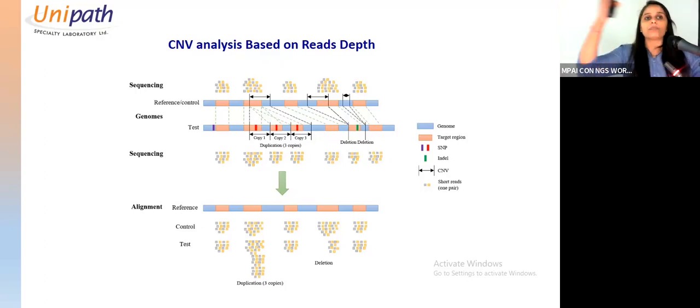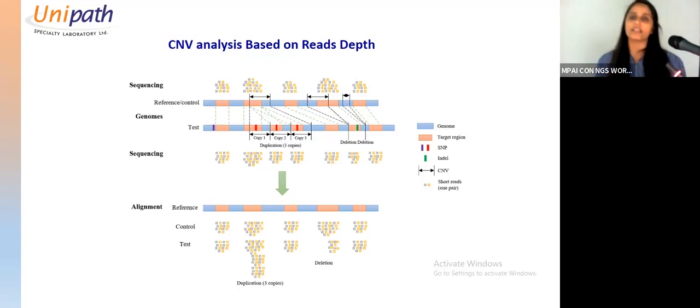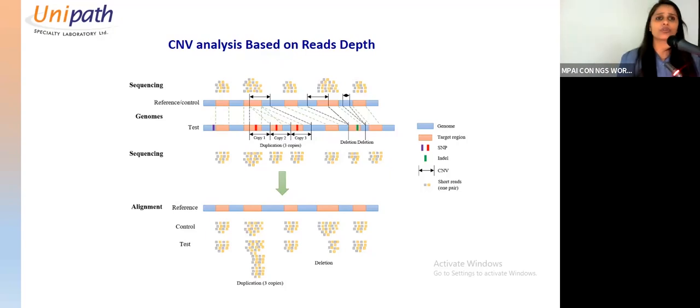Right? If you take a paper that is of red color, one color, and you tear it, you'll get red color pieces only. But if you take a paper which is multicolor, and you tear it, you'll get multicolor pieces. So similarly, if you are taking a control sample where everything is the same, you'll get coverage everywhere, because you generated data for the complete exome. But it is not like that, it is a probe-based enrichment, so definitely there is low and high depth, which means you have some places which are well covered and some which are less covered. So it happens in exome. That is the limitation of exome.